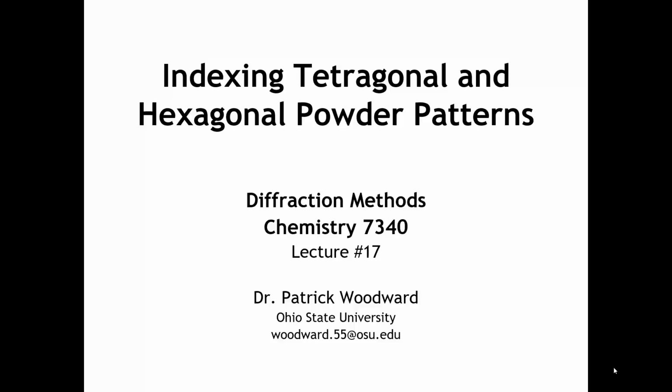As a general rule, we're going to have to resort to computer programs for indexing most powder diffraction patterns. But if we don't decrease the symmetry too much, either to the tetragonal or hexagonal crystal systems, where there are two variables which define the size and shape of the unit cell, it is still sometimes possible to index these patterns manually. And we're going to go through a couple of examples in this lecture.